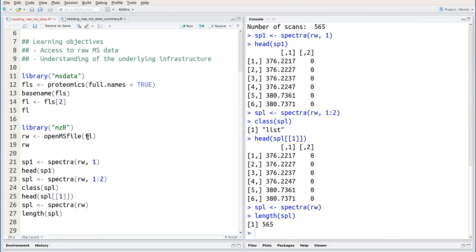There is much more information that we can access. In particular, we can access the annotation for all these individual spectra using the header function that takes this file handle as input.